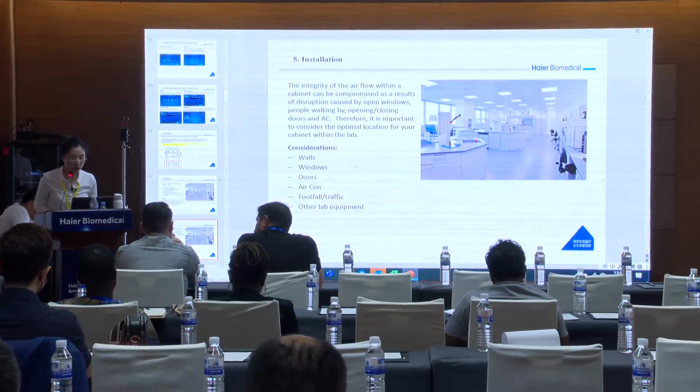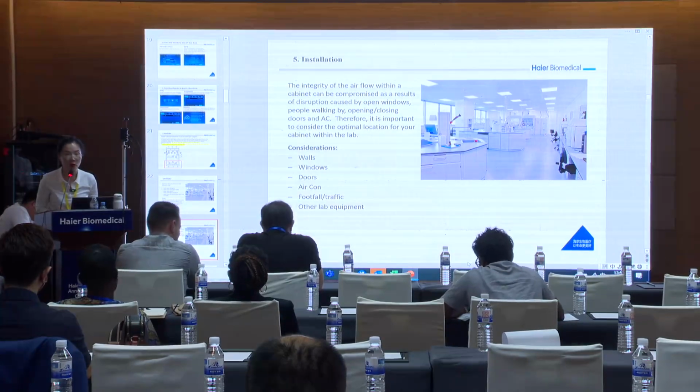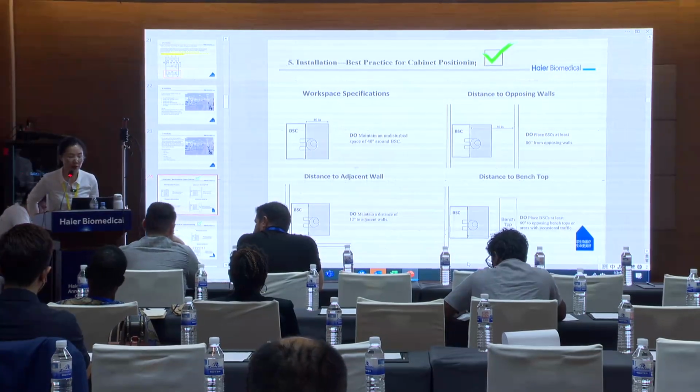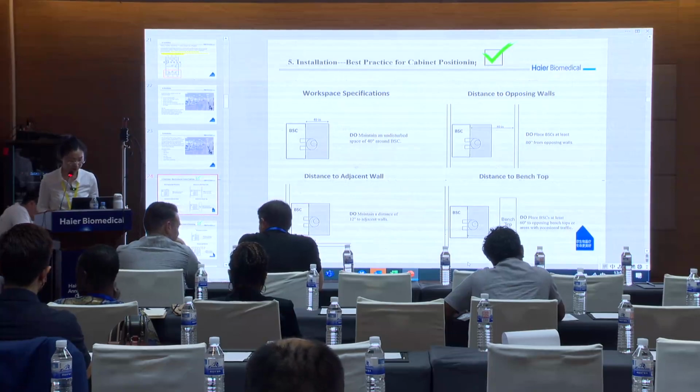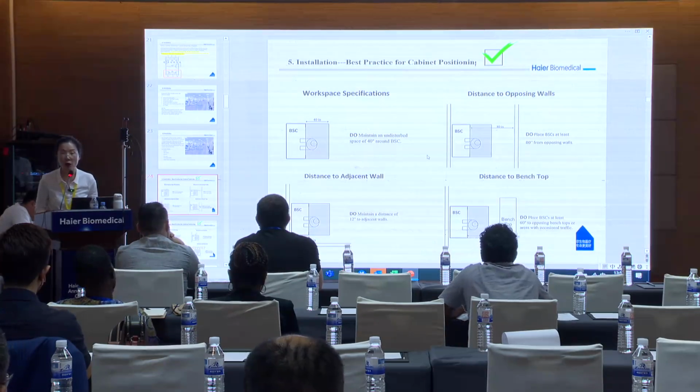When we do installation, we should consider the walls, windows, doors, air conditioner, footfall traffic, and other lab equipment. Now we will provide you the best practice for the cabinet position. In this slide, this position is right. It could be installed like this.